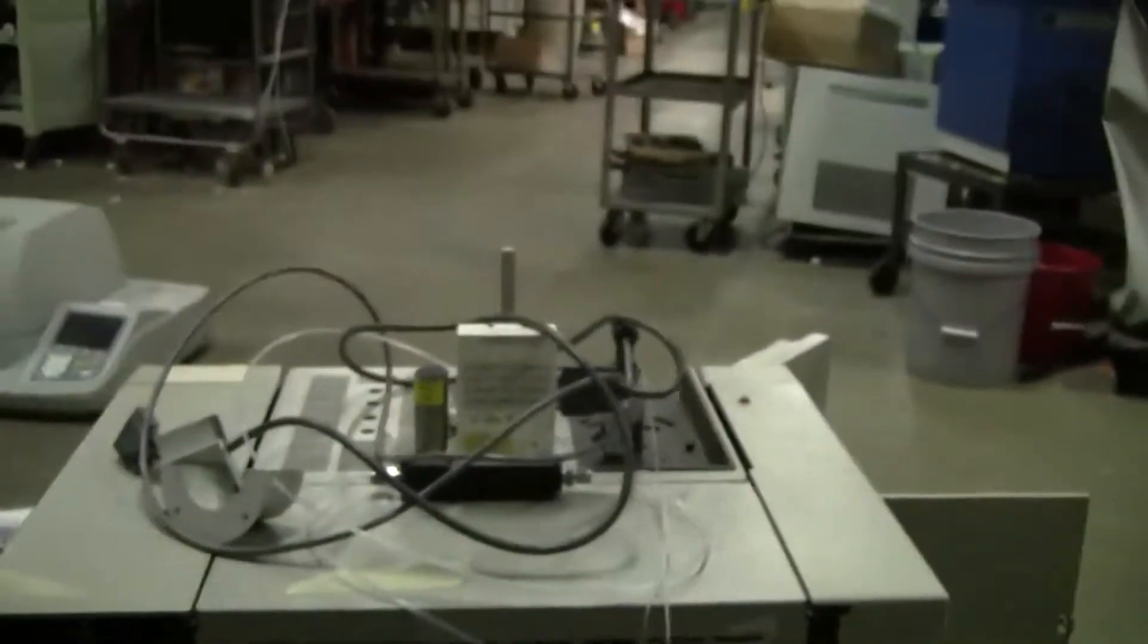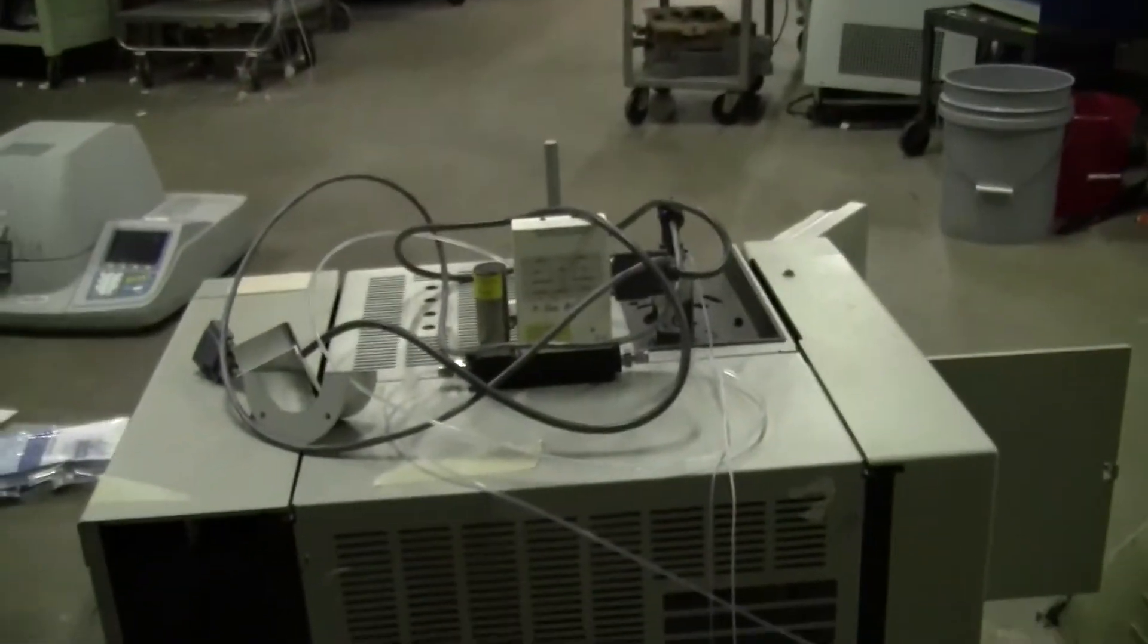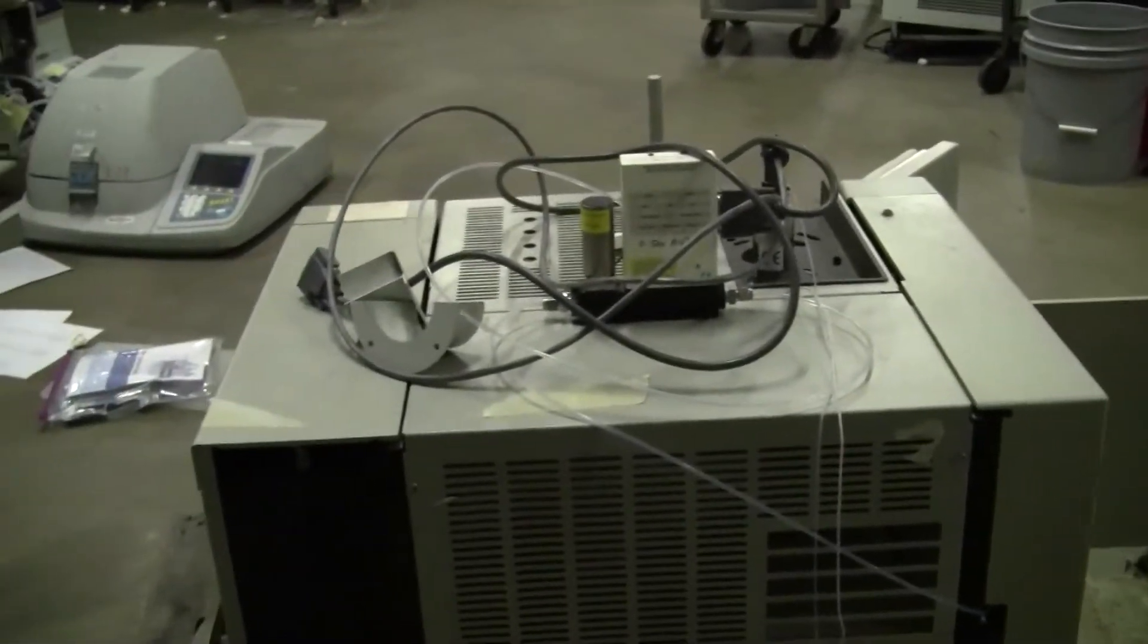The configuration in the back. Looks like they were running it off an integrator.